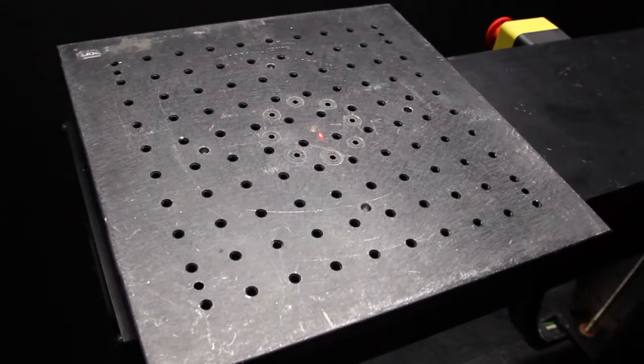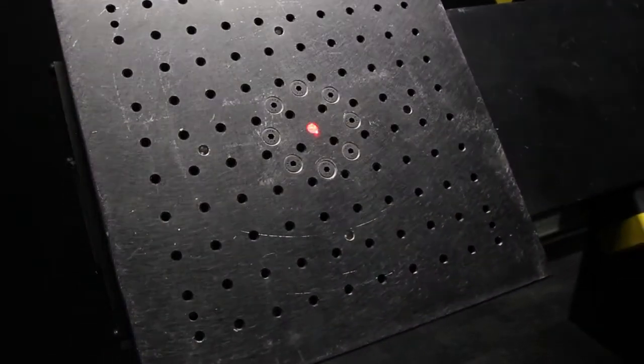Everything's controlled independently, the motors, the light, so positioning is always accurate and it's laser aligned with the sensor at the end of the hull.